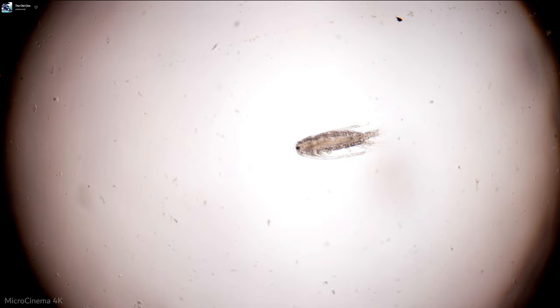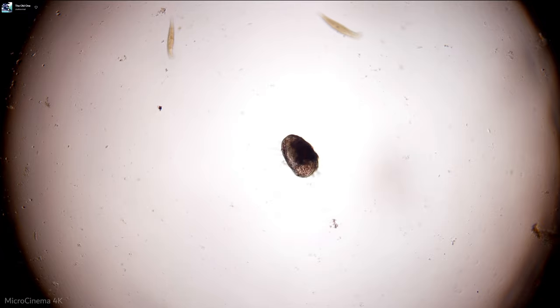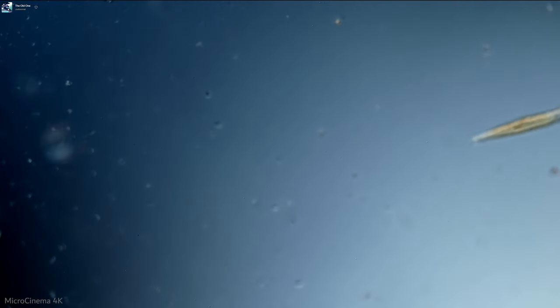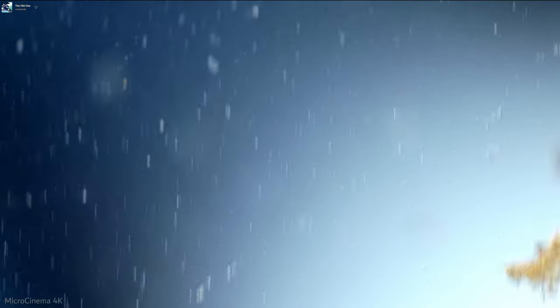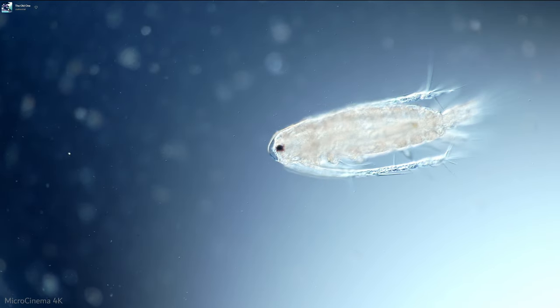So here is one of my copepods, and it's unfortunately not doing so hot. Look, we got this little, I think it's an ostracod. And we got some little critters here. We'll have some fun. Let's go ahead and switch into DIC here. Take that off. And bump that up to that. Boom. Yeah. So this is actually super, super interesting. There we go. That's good. Where'd that little guy go? What's this? There's that copepod we were looking at.